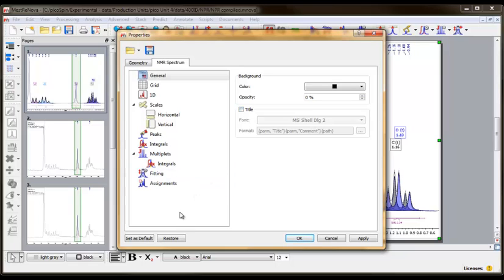Now, click the Set as Default button in the lower left-hand corner. This will now be the default action MNOVA applies to spectra the next time you open the program. Click Apply, and then OK.